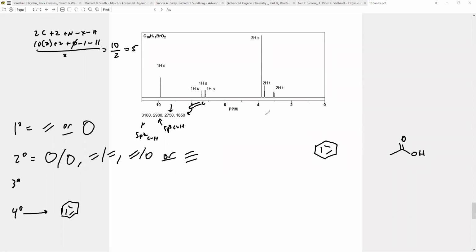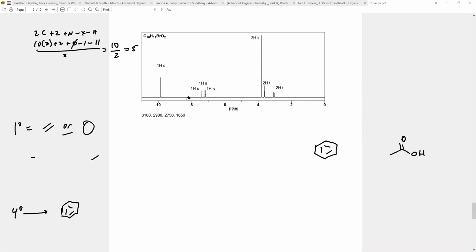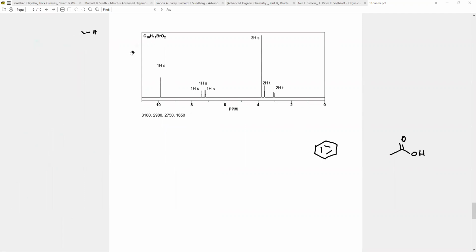Now before, when we had a benzene problem, what we had was a 5H. I think it was the second problem on here. That meant I have 5 hydrogens all on here, and then 1 position for a carbon chain. But when I look here now, I have 3 hydrogens, and so 3 hydrogens means that I have 3 positions that are not hydrogens.